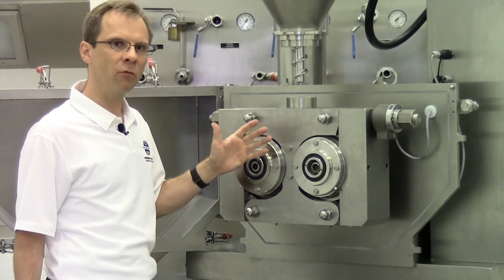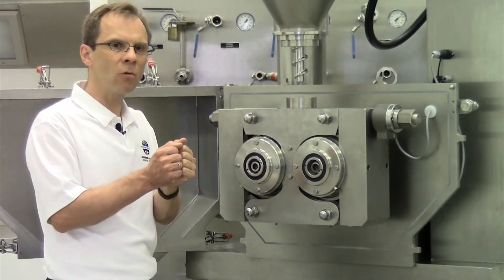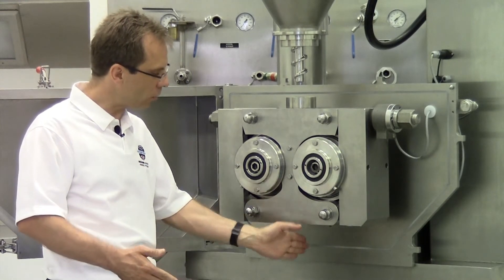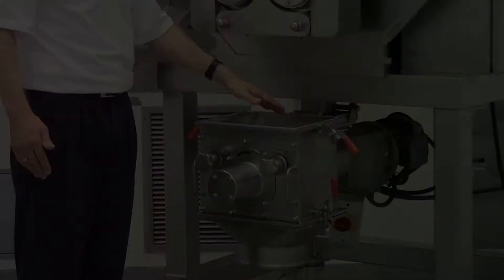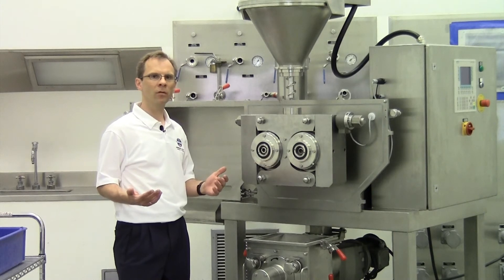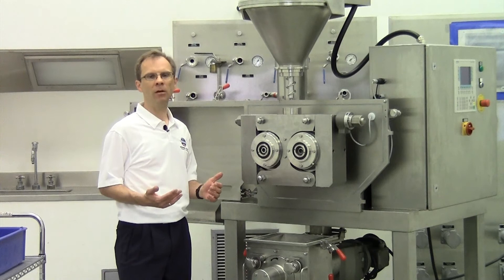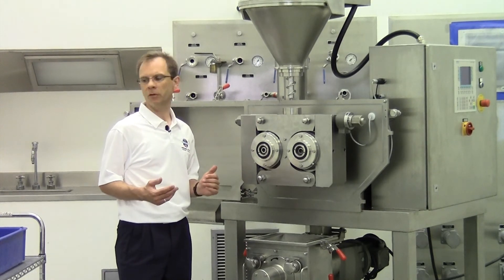With these high pressing forces we are able to press the powder so close together that we get a uniform flake which comes out of the rolls and can be crushed in the flake crusher. The biggest advantage of this Pharma Pactor is the combination of very high pressing forces, its robust design, and also good cleanability and maintenance.